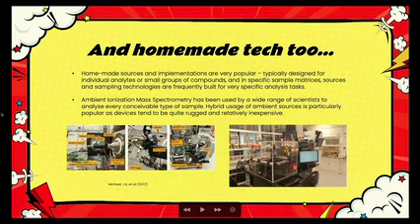The other thing that ambient mass spectrometry benefits from is that the sources tend to be, in mass spectrometry terms, relatively inexpensive, so they're well suited to being used in homemade applications or adding one or more ambient techniques together to do multiple different types of ionization in succession.